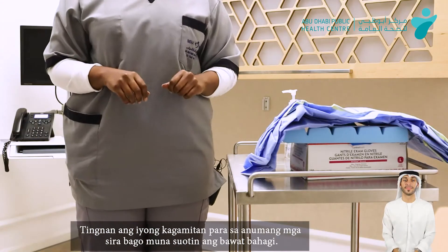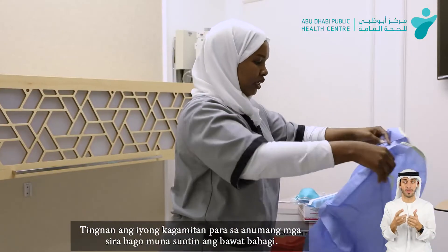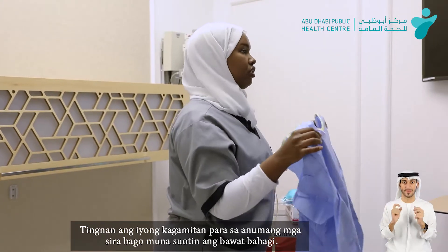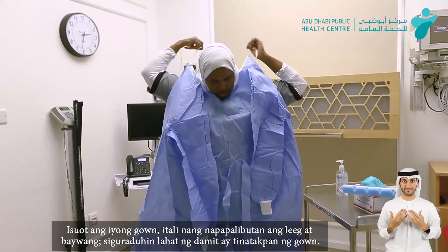The second step will be using the gown. We'll check visually that the gown is not corrupted, there are no holes, it's in perfect condition for use. We'll start by closing at the neck.